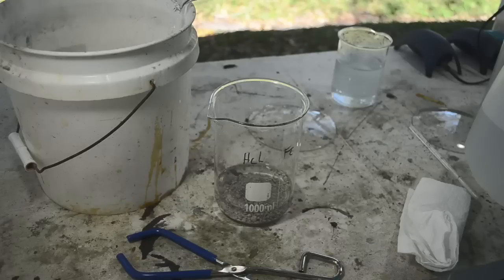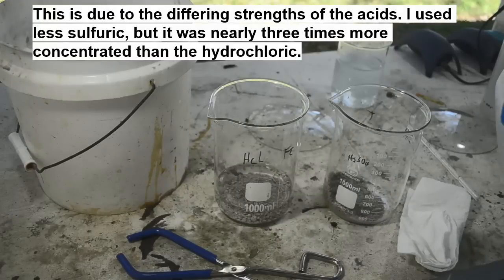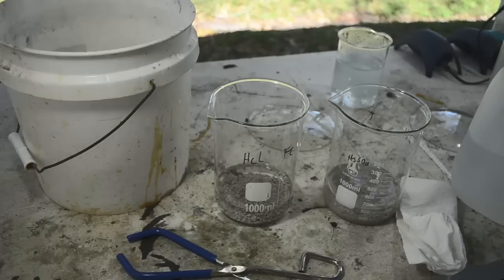And it's interesting. This is the one I did 20% acid. This is the one I did 10% acid. And this is the one that's taken more rinsing to get it down to neutral. Very interesting. Very interesting.